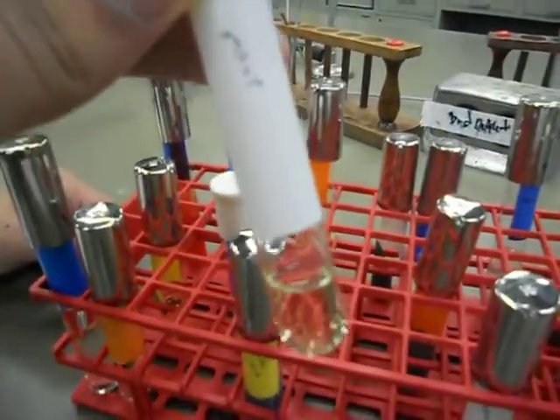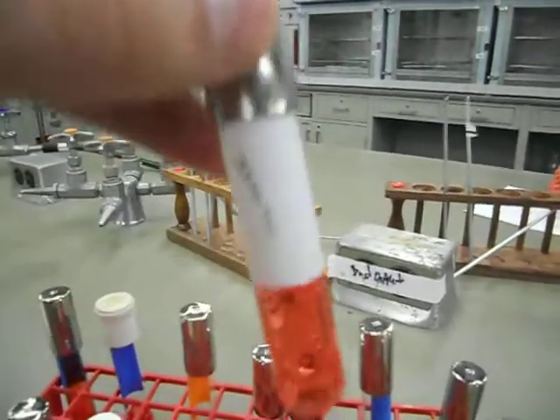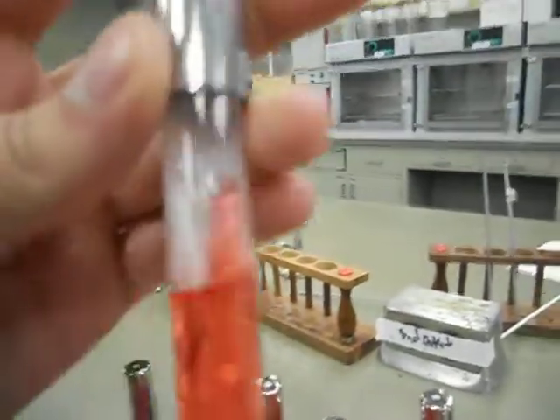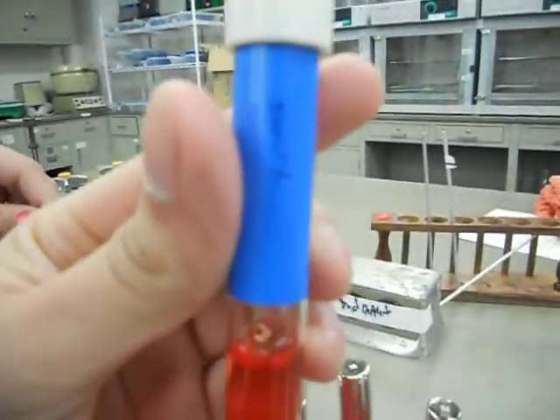MRVP — it looks like nutrient broth. Mannitol, it's red. Is there a tube in it? Yeah, for glucose and lactose. There's the glucose — same thing. Glucose is the same thing.